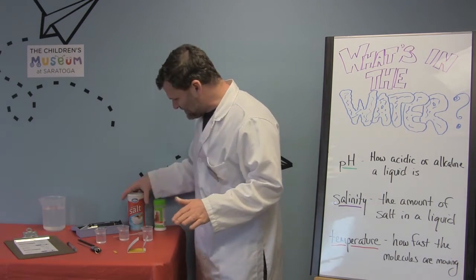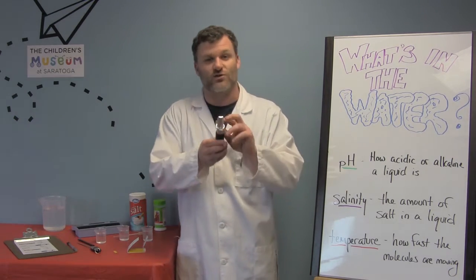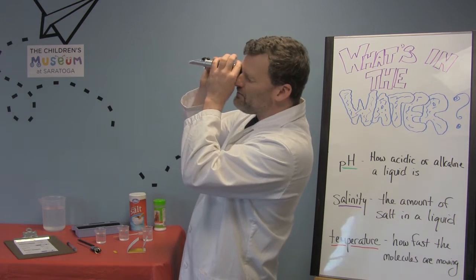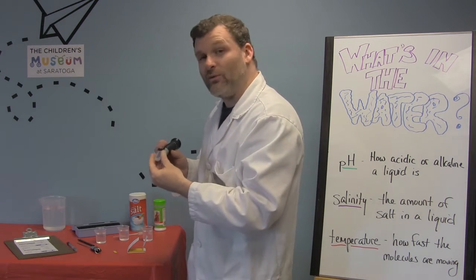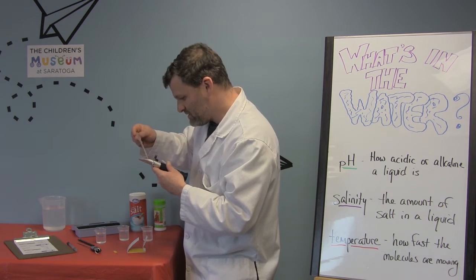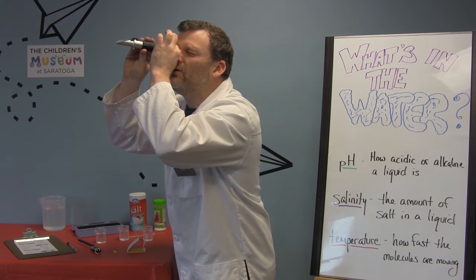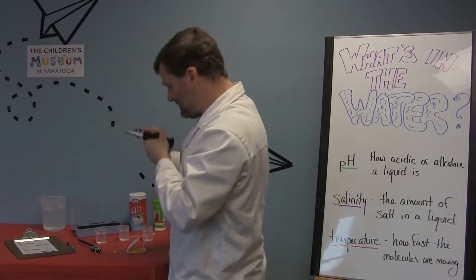Now the next thing that we test is the salt — the salinity — how much there is in there. For that you have to use a special device called a refractometer. You put the water on this part right here and close it. If the water has no salt in it, when you look through there's a little line — it's blue — and it'll show white to show how much salt there is. So we'll take a little drop of salt water, put that in here, close it gently, and I can see that we've got ten — it looks like about ten out of a hundred on our salinity scale.